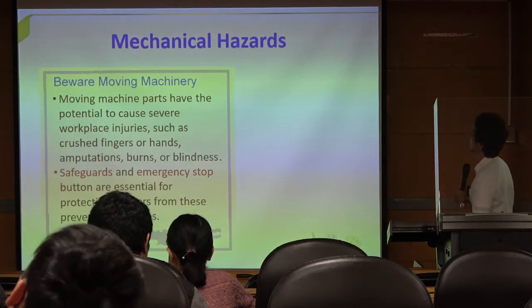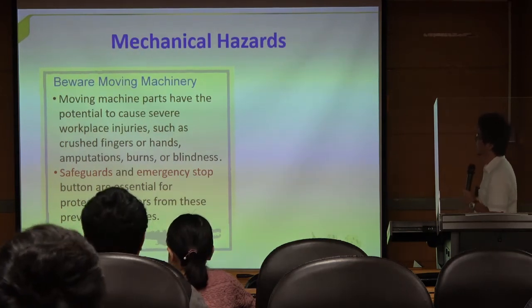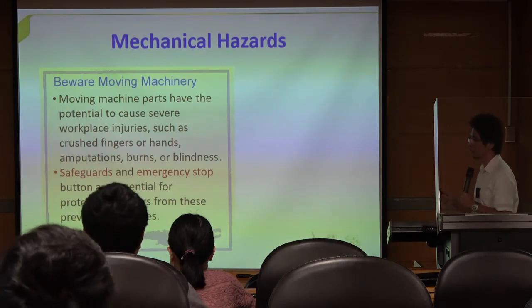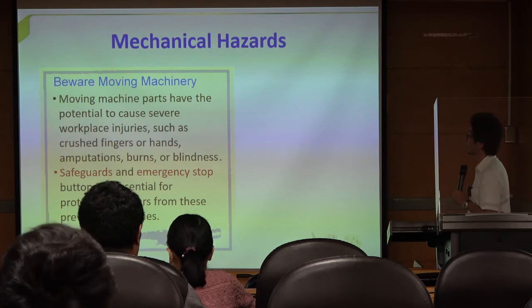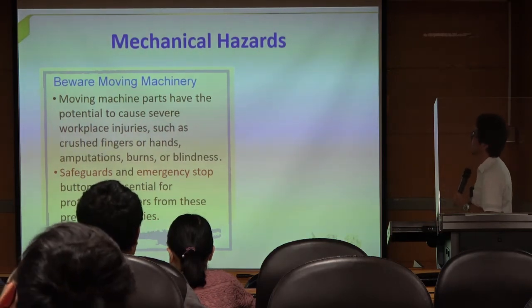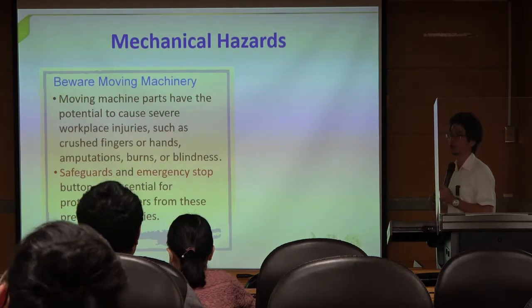Okay. Then we go to the third hazard, the mechanical hazards. I think of this video I will only show you one, because it's a horrible video you can see on YouTube. And be aware of moving machinery. Moving machines are very dangerous.